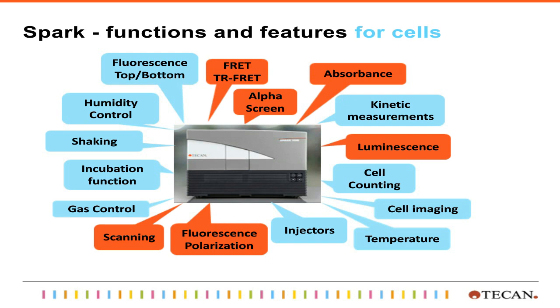It offers integrated gas control to control levels of CO2 and O2 inside the measurement chamber. It offers injectors that can be used to directly inject cells into the well, so direct seeding of cells into the microplate. It has a very elaborate temperature control function, not only above ambient temperature, so not only heating of the instrument, but also cooling below ambient temperature.